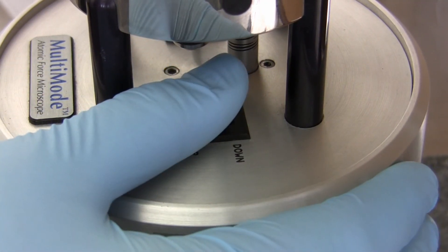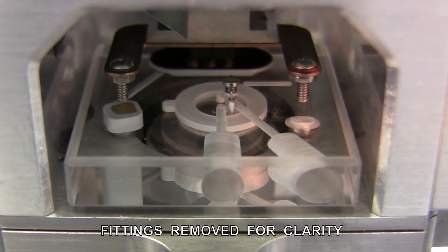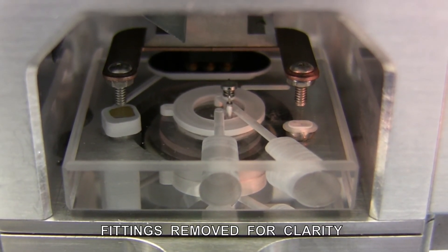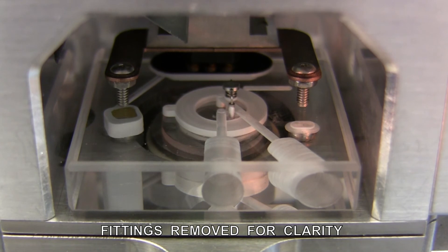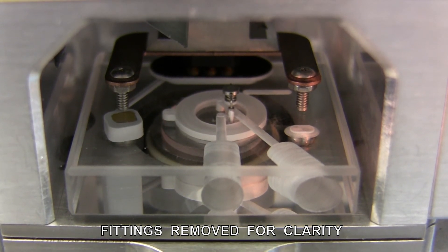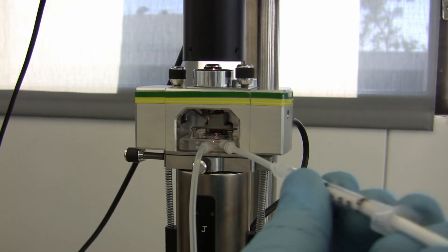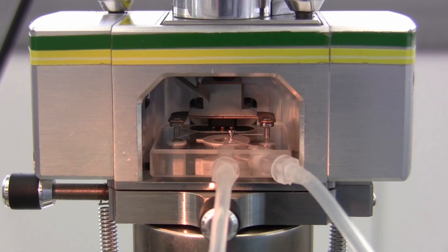Use the motor manual switch to lower the head down to bring the rubber seal into contact with the sample. Take care to leave sufficient space between the probe and the sample surface. Inject the liquid into the cell until the fluid level fills the cell and drains away from the exit port.